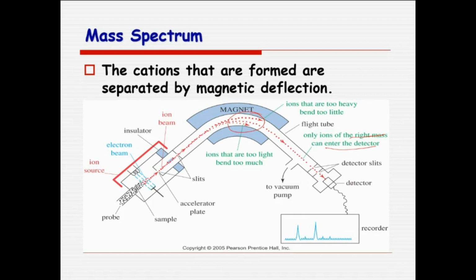Okay, and they go to the detector as m2. So they have ionized here as m1, but they go to the detector as m2. During the flight, they get ionized. So the peak we get is generally a broad peak in the spectrum, known as the metastable peak. The metastable peak is generally given by m star. M star is equal to m2 square by m1.